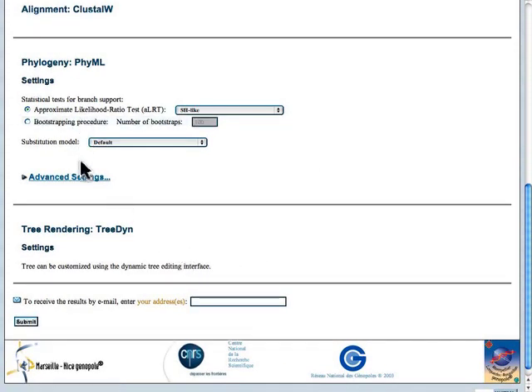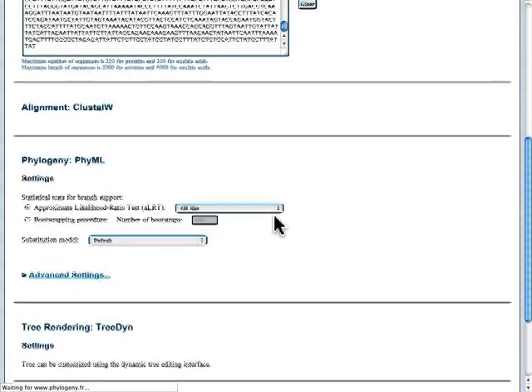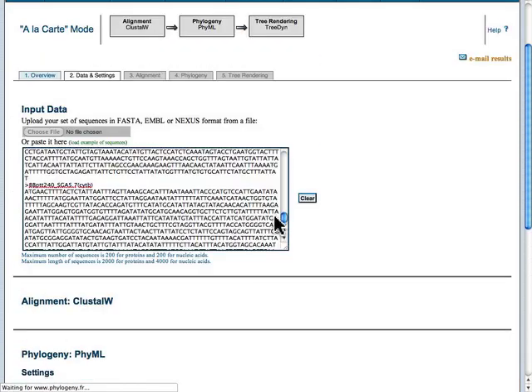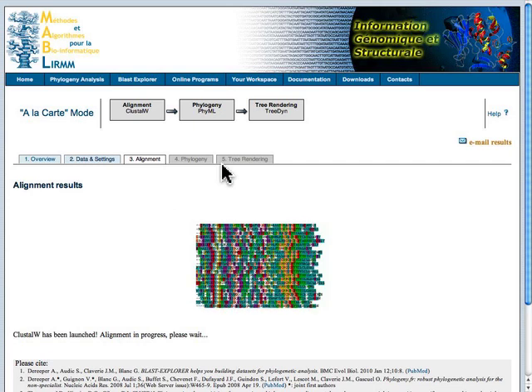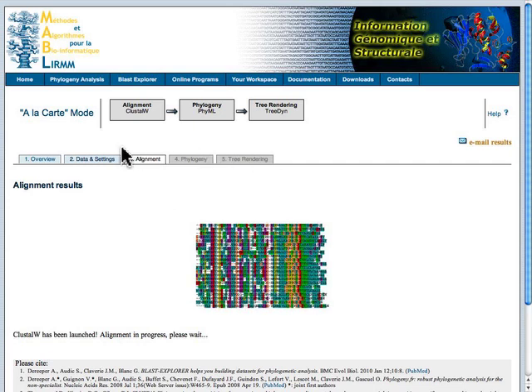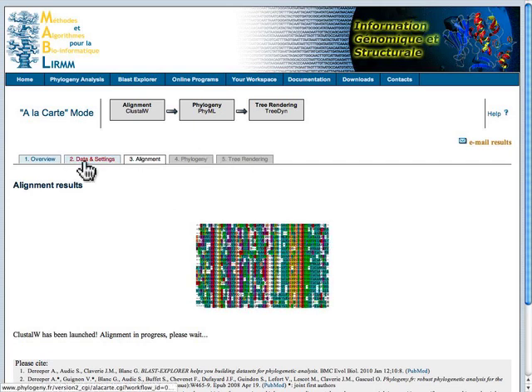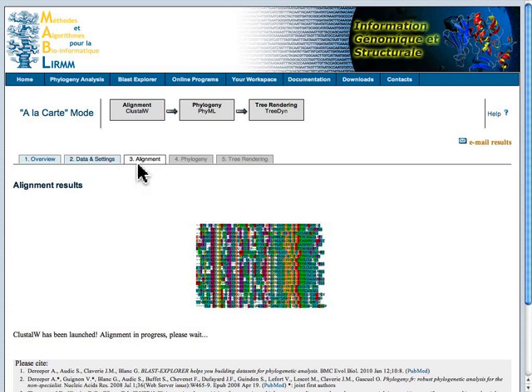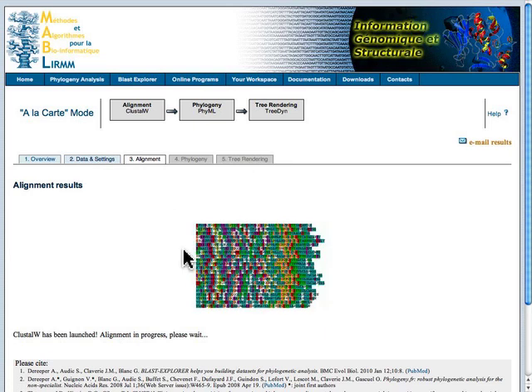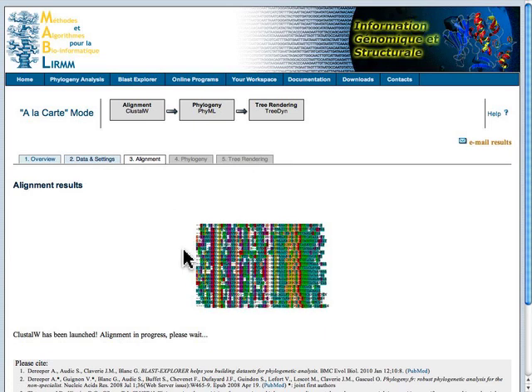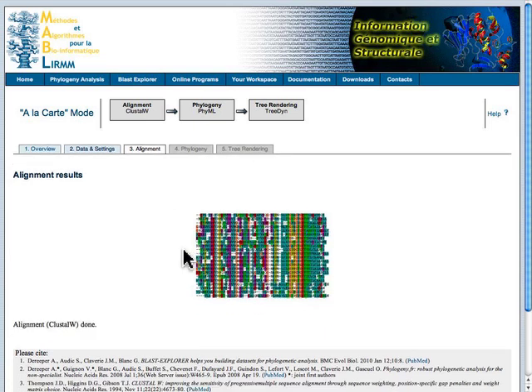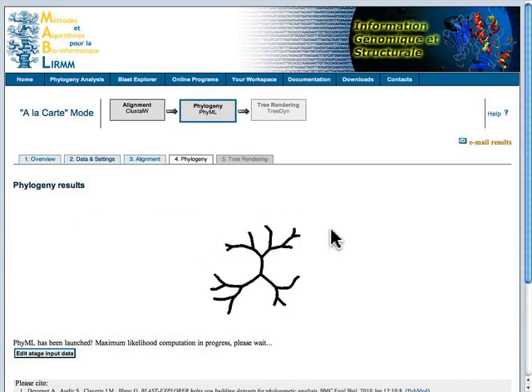We have the option to set some parameters for those steps of the analyses. At this stage, we're just going to run with the defaults. So, I've clicked the submit button. And you can see now that the workflow has moved from the data and settings step to the alignment step. And we've got this nice little animated graphic showing us that it's working away on the alignment, trying to find the best arrangement of those sequences.